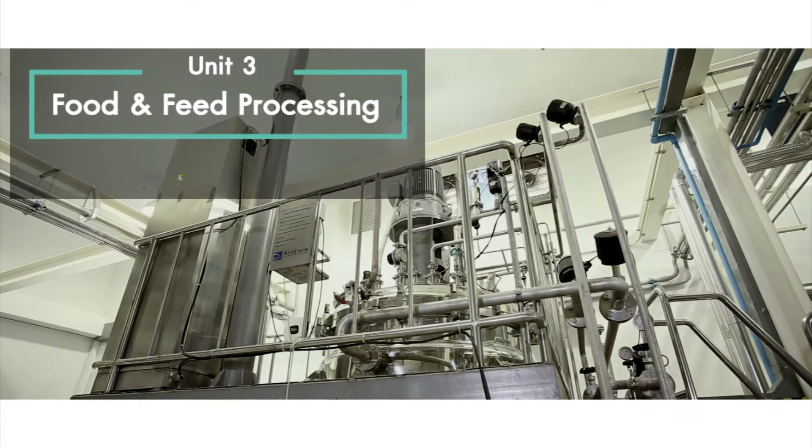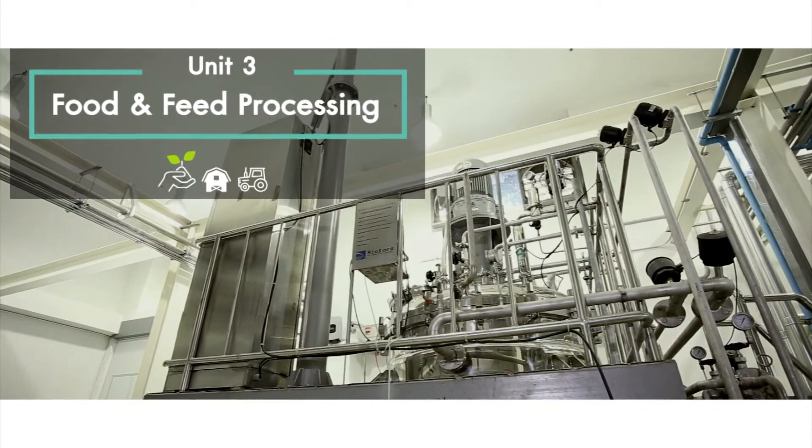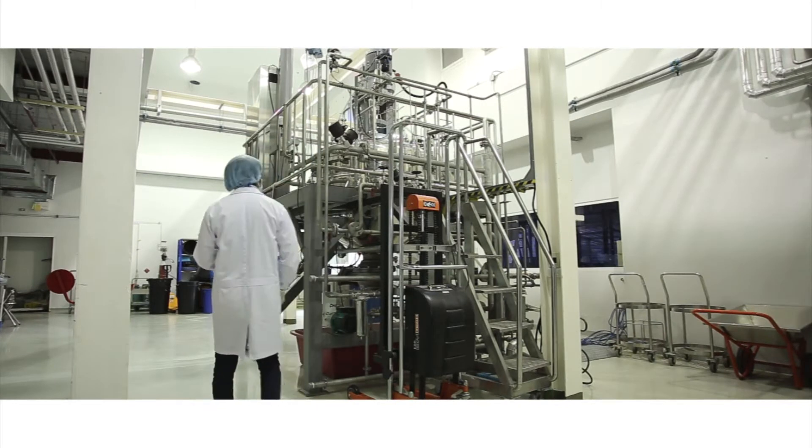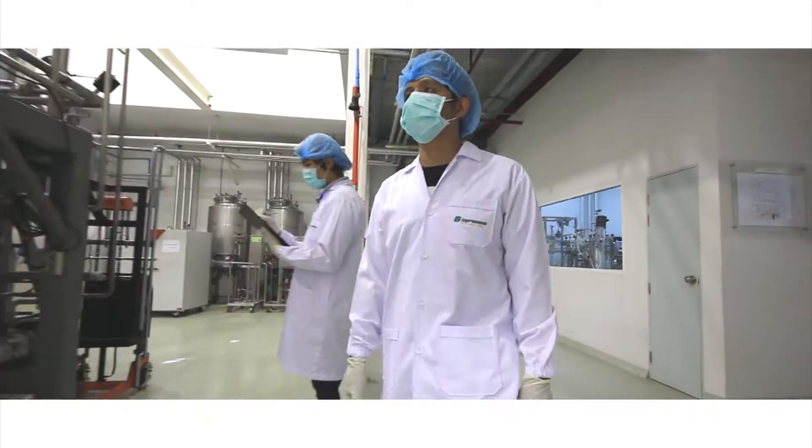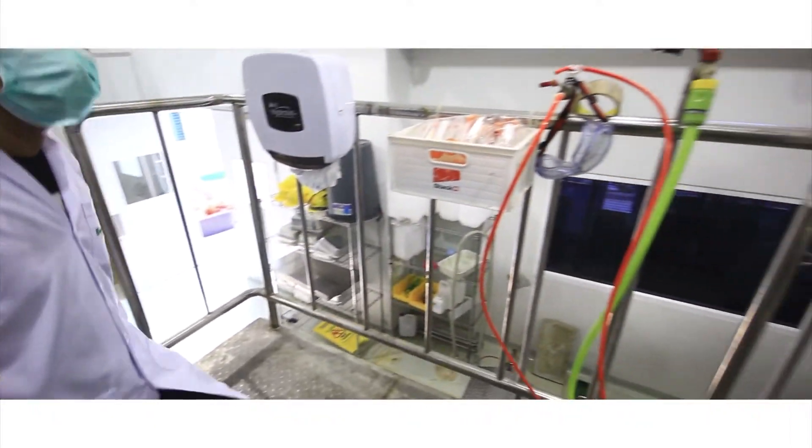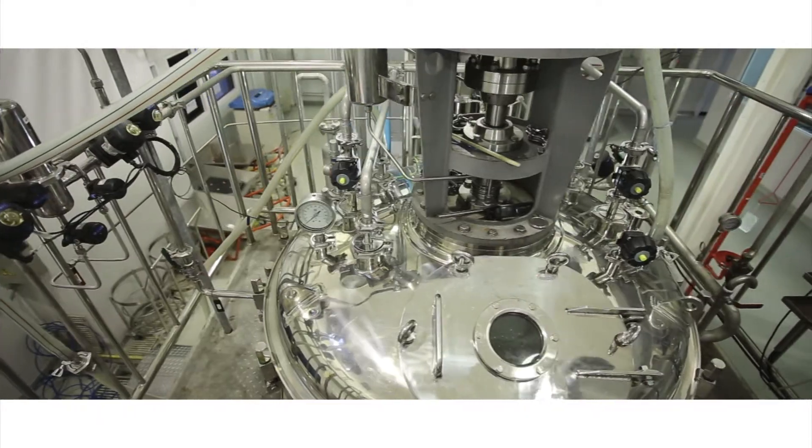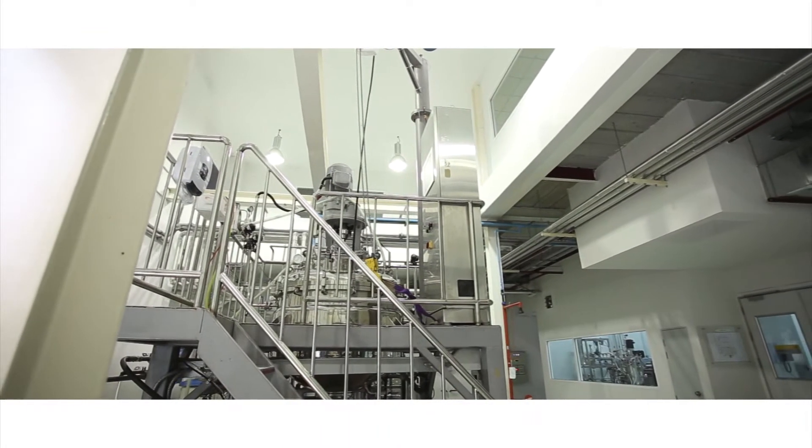Unit 3: Food and Feed Processing. This unit serves to scale-up research activities for food and feed processing by solid-state fermentation and downstream processing, such as drying, product formulation and analysis, as well as assessment of product storage and shelf life.